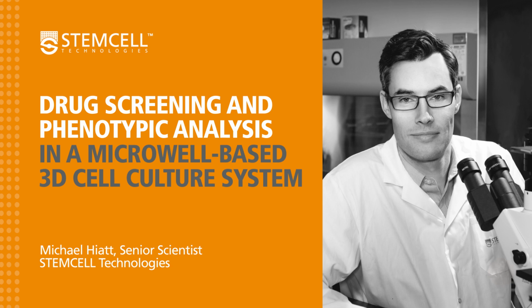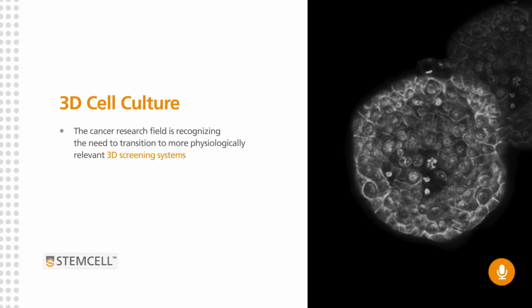Today I'm going to talk to you about a poster that I presented at the 2018 AACR conference. So why do we care about 3D cell culture or want to use phenotypic analysis? Recently, phenotypic analysis methods have seen a resurgence for screening applications. We will show an example of a drug screen of 3D cancer spheroids and show that image-based phenotypic measurements can be used to detect treatment effects. We will also show this can be performed with basic tools and procedures available to anyone.